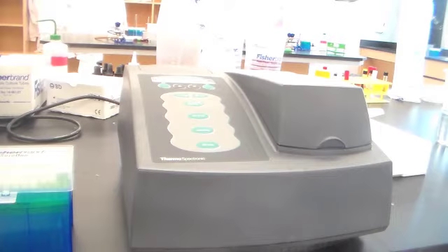So in the next portion of this, at this point you're not counting viable cells, you're counting total bacterial cells. In that cuvette, a dead bacterium will absorb or diffract light to the same degree that a living bacterium will. So this is in essence looking at total number of bacteria.